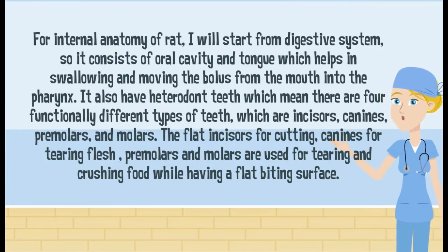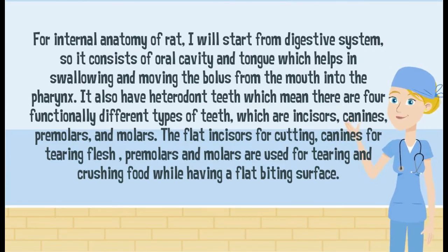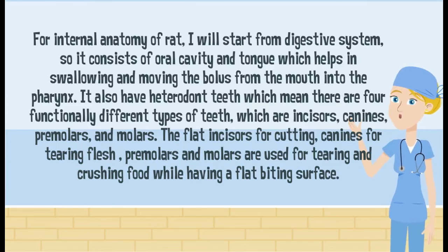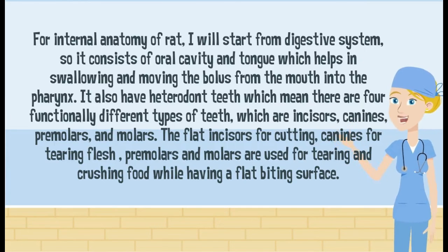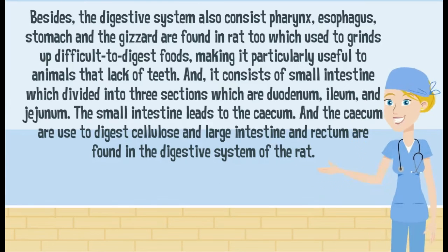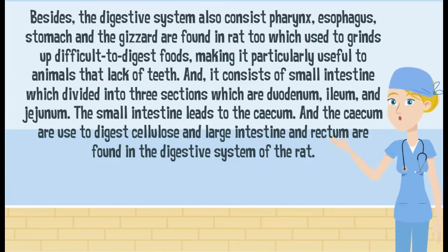For the internal anatomy, starting with the digestive system: it consists of the oral cavity and tongue, which helps in swallowing and moving the bolus from the mouth into the pharynx. The rat also has heterodont teeth, meaning there are four functionally different types of teeth — incisors, canines, premolars, and molars. The flat incisors are for cutting, canines for tearing flesh, while premolars and molars are used for tearing and crushing food with a flat grinding surface.